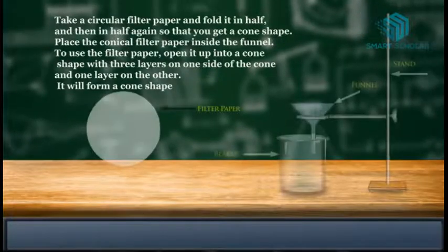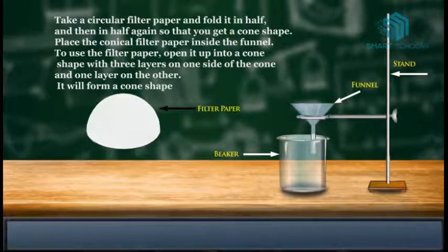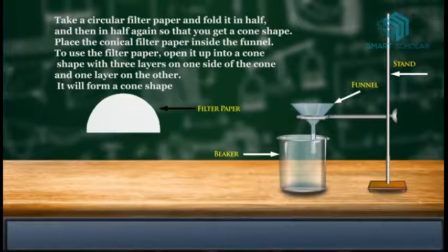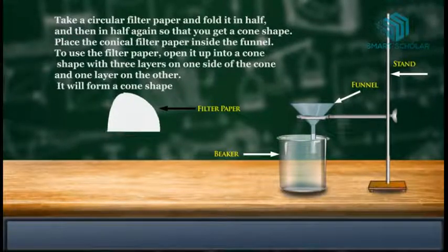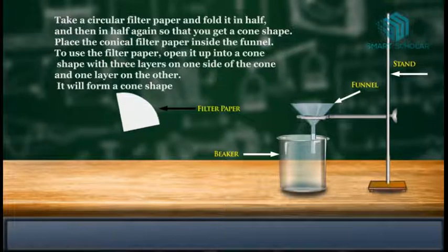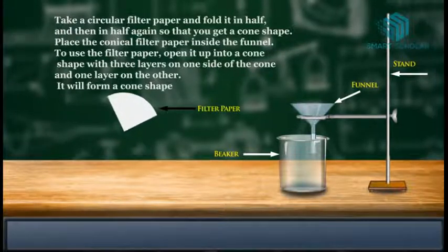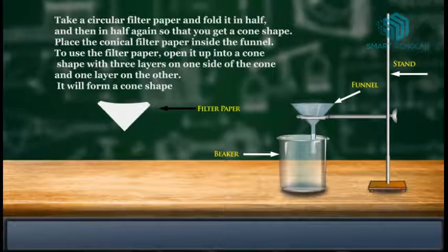Take a circular filter paper and fold it in half, and then in half again so that you get a cone shape. Place the conical filter inside the funnel. To use the filter paper, open it up into a cone shape, with three layers on one side of the cone and one layer on the other. It will form a cone shape.